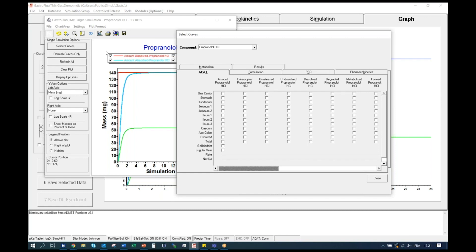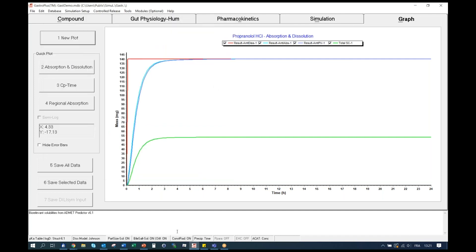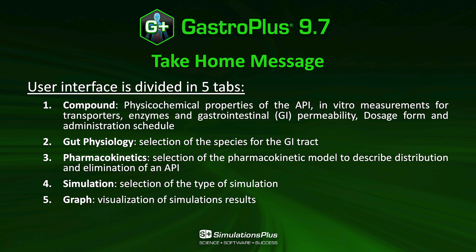This new plot capability will be used in future videos to look at specific tissues or specific administrations. To conclude this video, the take-home messages are that the GastroPlus user interface is divided into five tabs. First, the compound tab, which includes the physicochemical properties of the API, in vitro measurements for transporters, enzymes, and gastrointestinal permeability, as well as dosage form and the administration schedule. The second tab, the gut physiology tab, is where you will select the species and the GI tract state, whether fasted or fed. On the pharmacokinetics tab, you will select the model structure to describe distribution and elimination, whether compartmental or a PBPK model. The simulation tab is where you will select the type of simulation and the length of it. And finally, on the graph tab, you will visualize your simulation results.